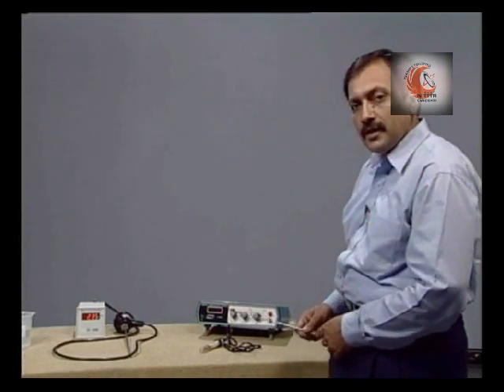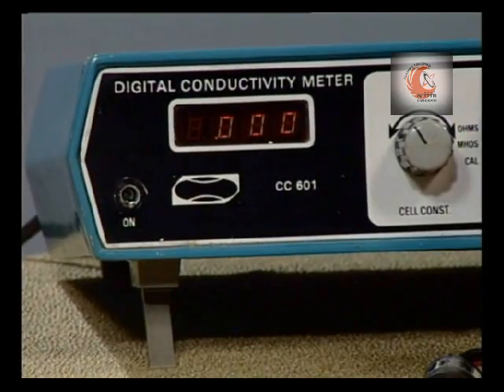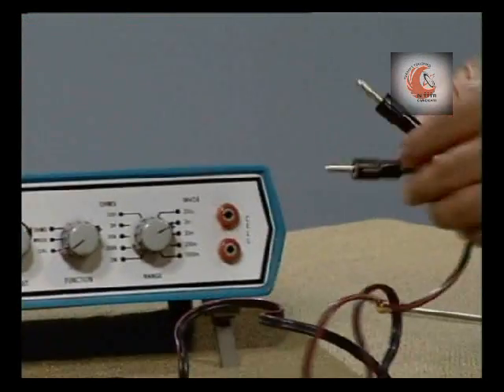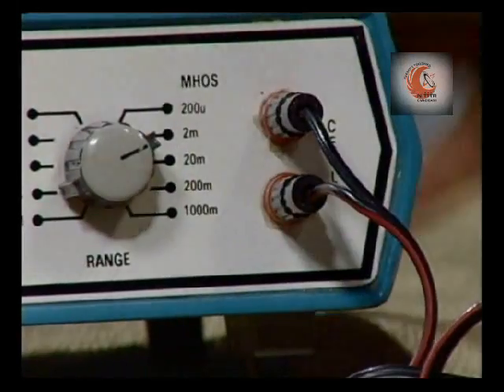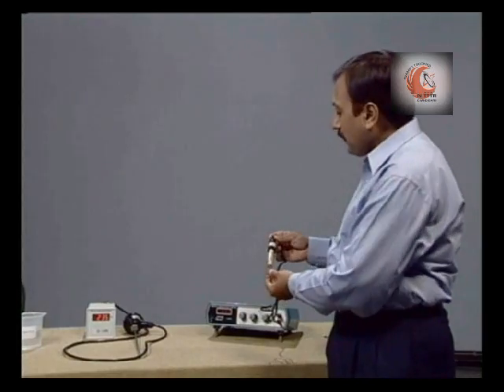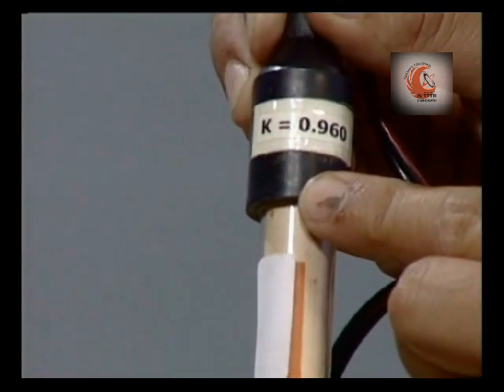Now, to begin with, we will switch on the instrument and allow it to warm up for some time. Connect the conductivity cell to the instrument. Now read the value of the cell constant which is specified by the manufacturer.